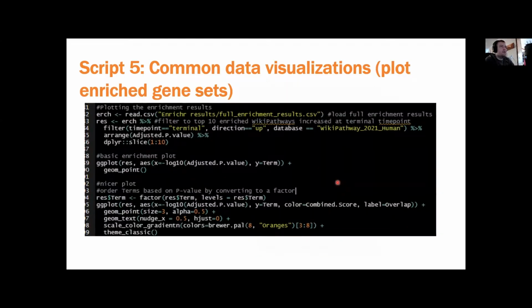And so the final thing that we'll go over for data visualization is plotting some of the enrichment results. Technically, for a paper, all you really need to show is just a list showing your enrichment results, but there's also lots of different ways for plotting these results. I've basically just shown a generic way of plotting it.